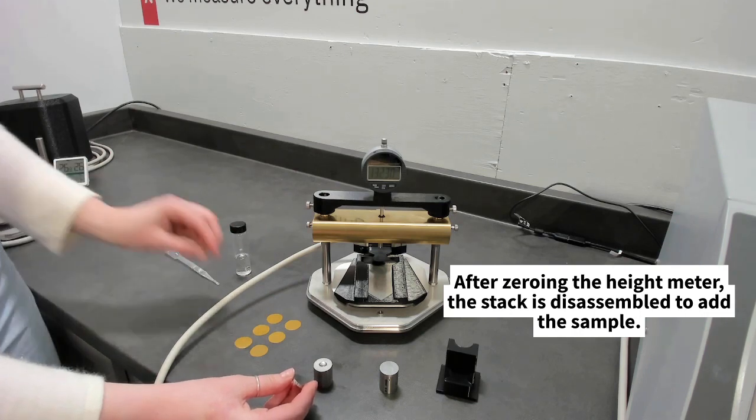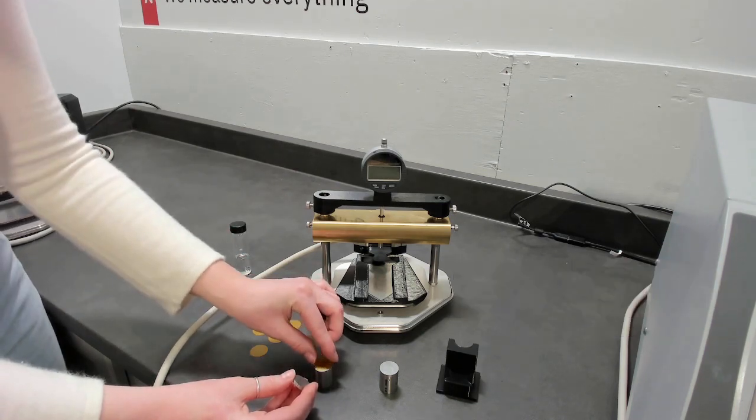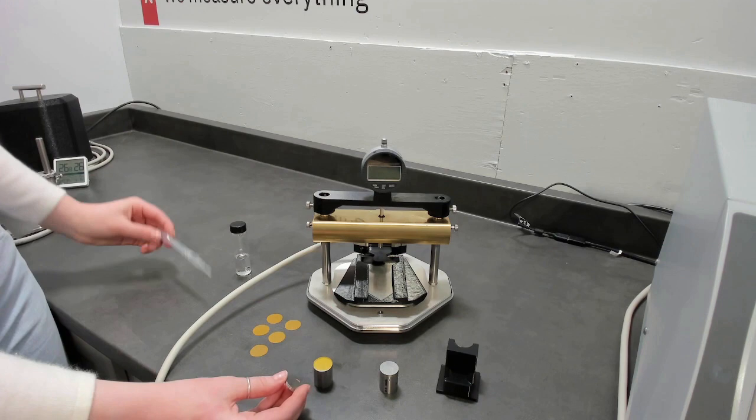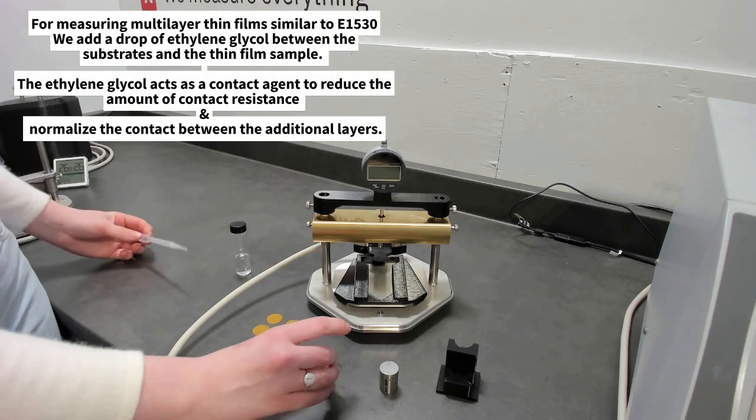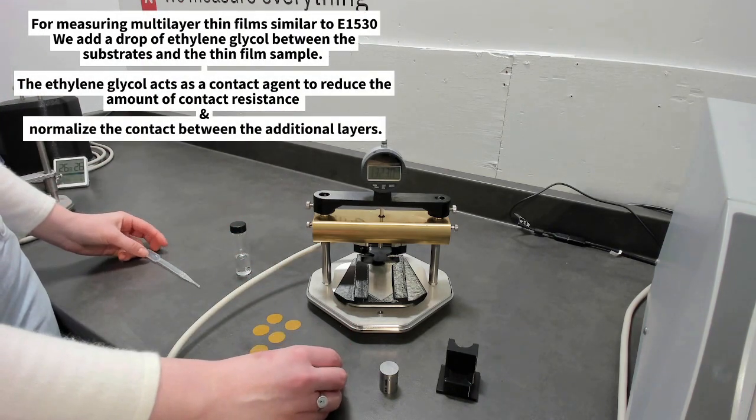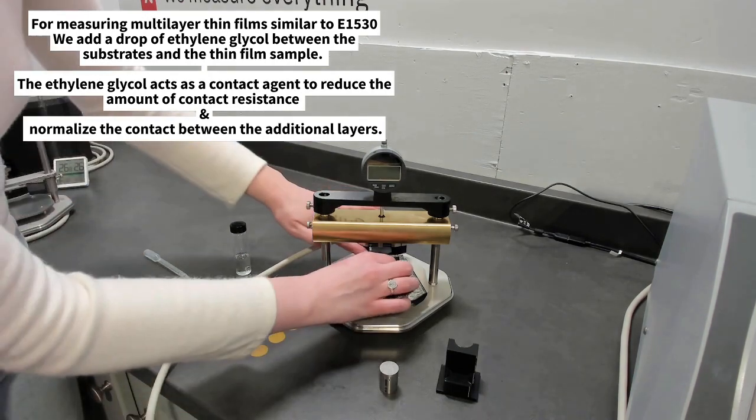For the measurement of multi-layer similar to ASTM E1530, we can use ethylene glycol or another liquid as a contact agent to normalize the contact between each additional layer we add.